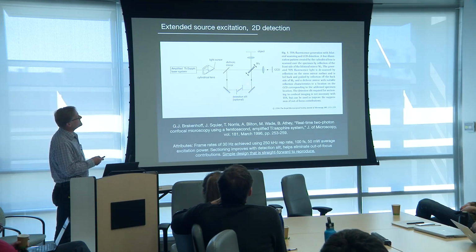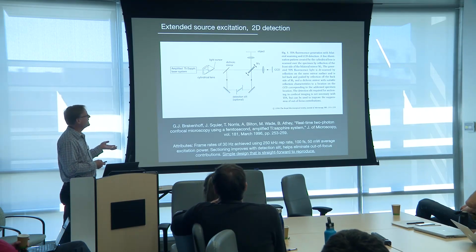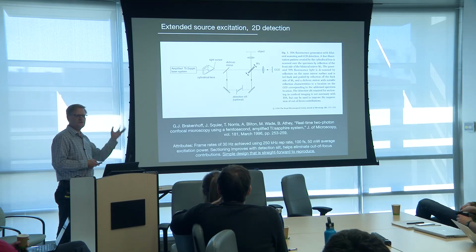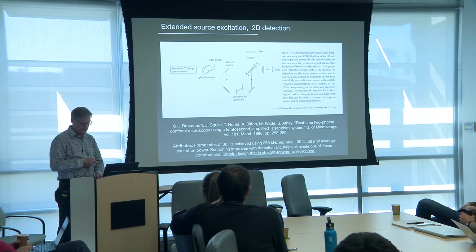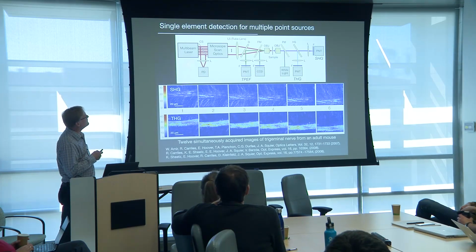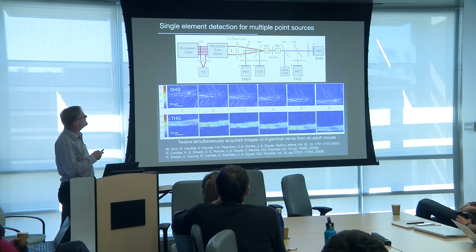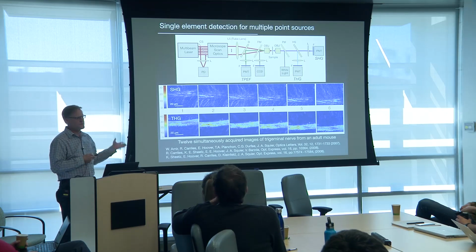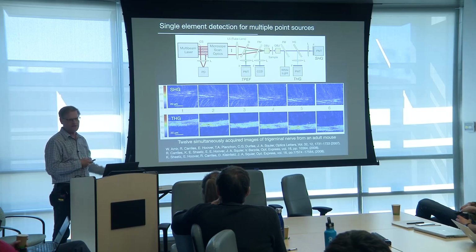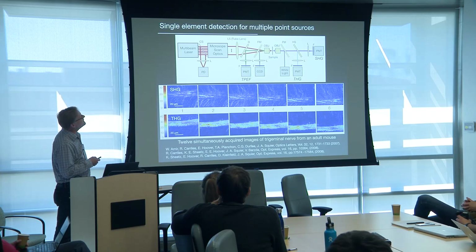The weakness was the scattering along the slit. So we were kind of inspired by this, and we said, okay, well, is there a multifocal approach that we could use? So going to extended sources to kind of help mitigate that. And that's where we started developing all these multi-beam systems where we've time delayed all the beams with respect to one another over durations that are longer than the fluorescent lifetimes. And we do photon counting everywhere.